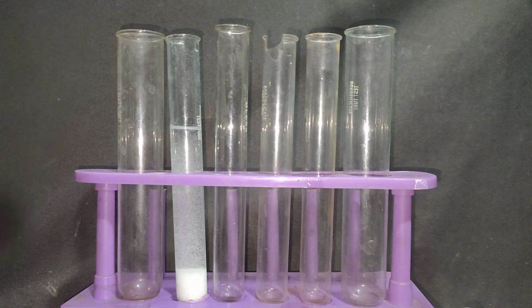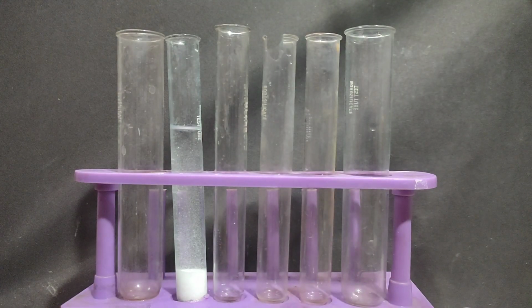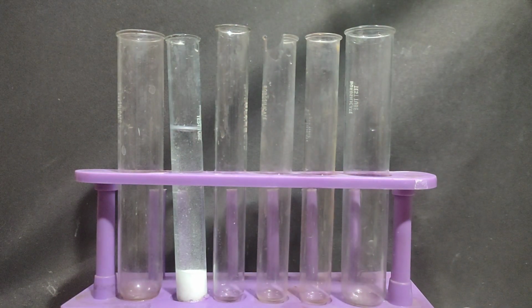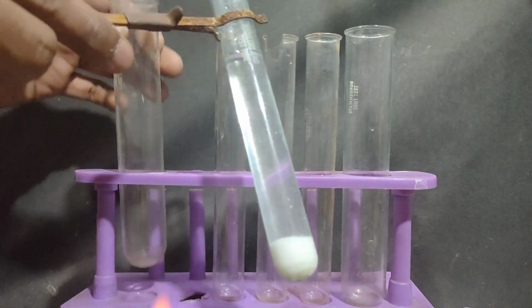So we will dissolve this. First of all, we will filter this solution and preserve the filtrate for analysis of group 2 and further groups. But since over here I am using only one cation, I will not be filtering this precipitate. I will be boiling the precipitate in the same solution. But if you are given a mixture of cations, then you have to do this. You can see that the volume has already become very large, so I'll be transferring all these contents into a boiling tube.